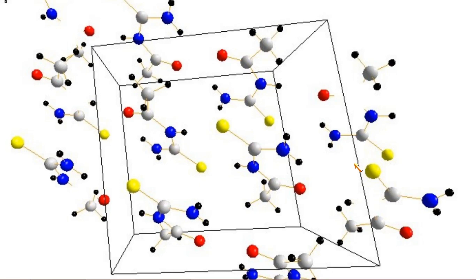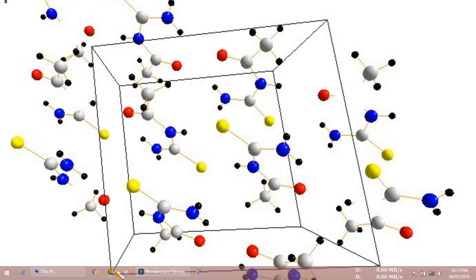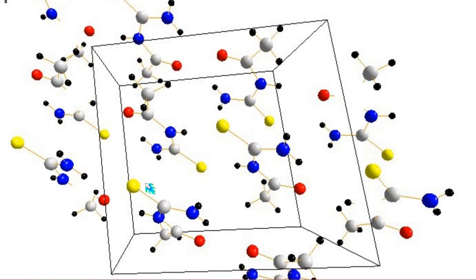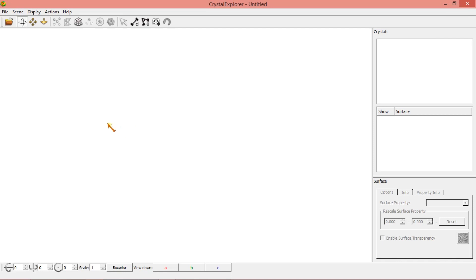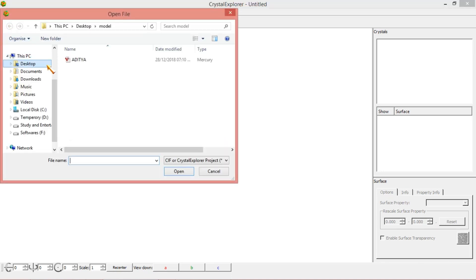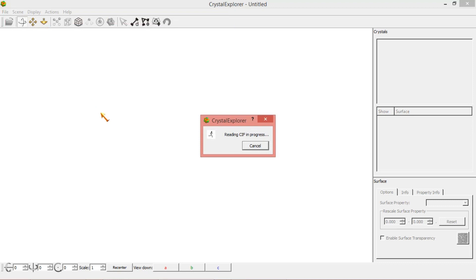Hi everyone. In this video I am going to discuss how to extract inter and intramolecular interactions using Crystal Explorer software. I am opening Crystal Explorer software and I am going to demonstrate inter and intramolecular interactions. Before getting inter and intramolecular interactions, I am opening one molecule.